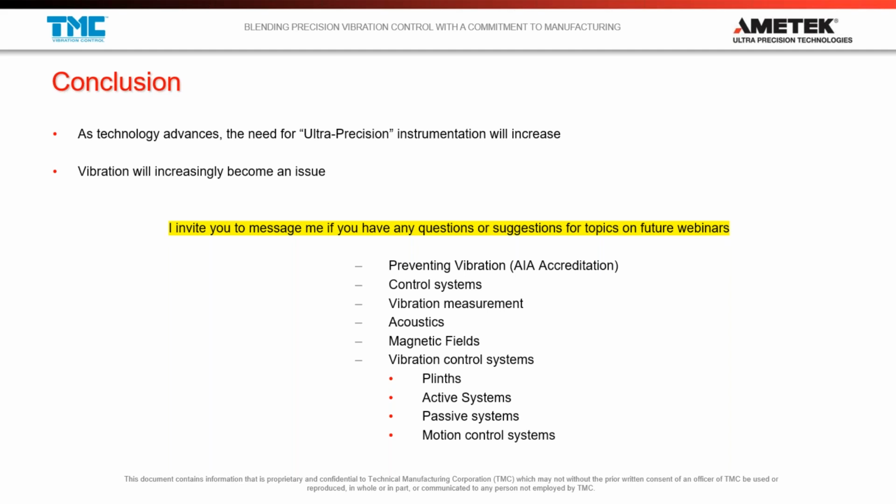Thinking about high resolution optical microscopy and microscopes, is it typically floor vibrations or acoustics of the room that affects the imaging performance most? Yeah, it's similar to the atomic force microscopy question we had earlier. It could be one or the other. It just depends on the facility and what your problems are.